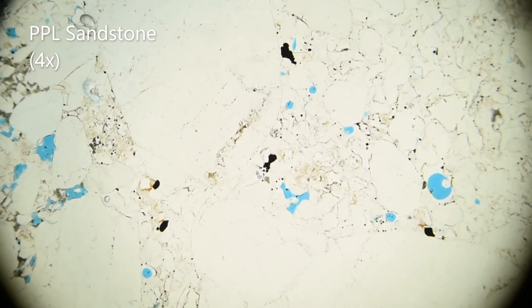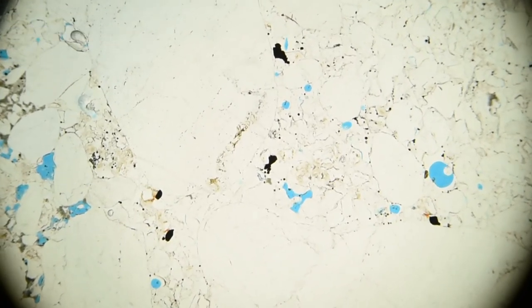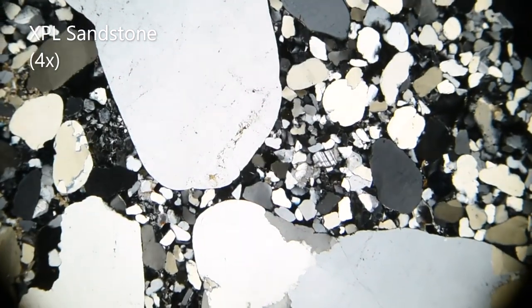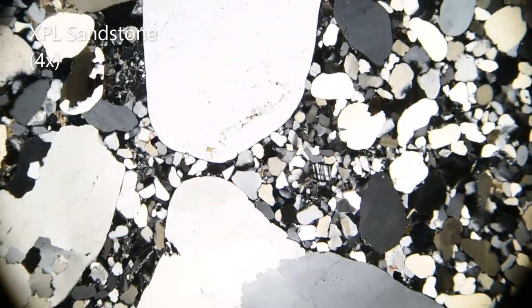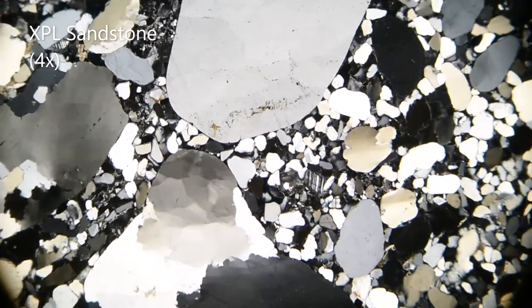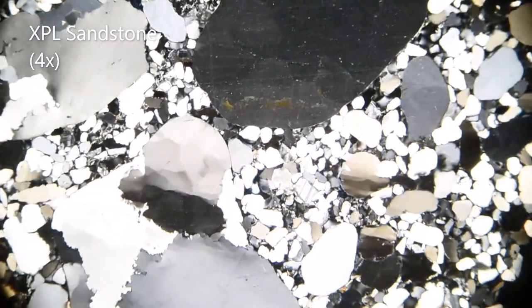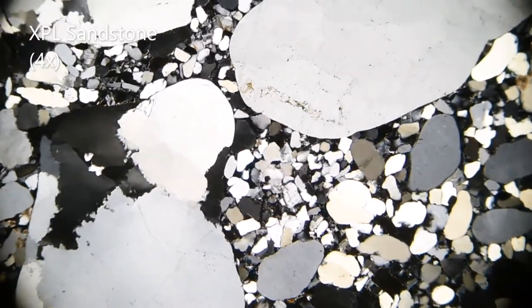This is a sample of quartz sandstone. In cross-polar light, quartz grains appear in gray tones. As the sample rotates, the grains cycle through different shades of gray. When the grains go completely dark, this is what we call extinction.